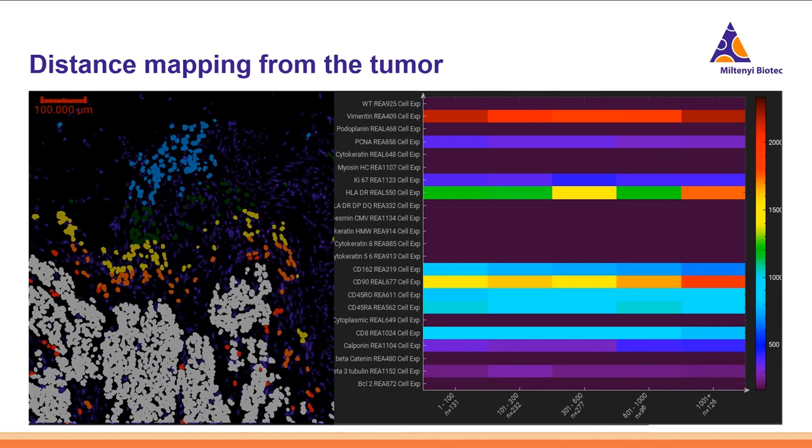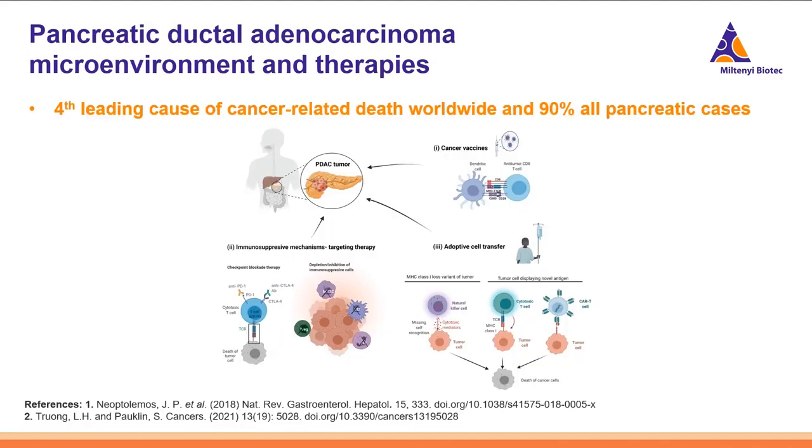And to wrap up, I'd like to give an example in which we can use these techniques in specific immuno-oncology applications. I'm going to be focusing on a particular area of interest here at Miltenyi Biotec: looking at the pancreatic ductal adenocarcinoma microenvironment and then certain therapies to treat it.